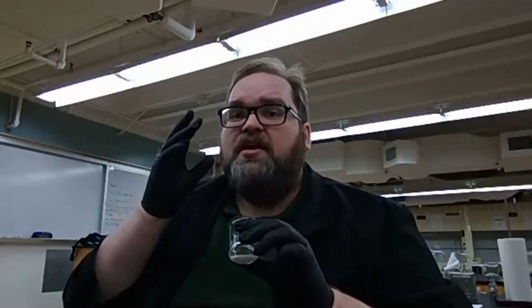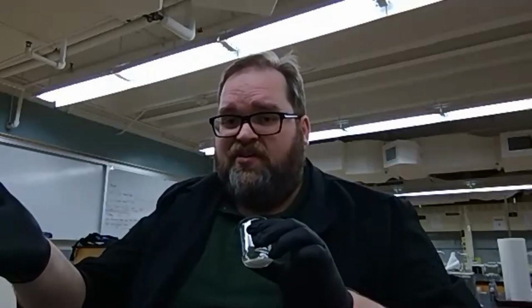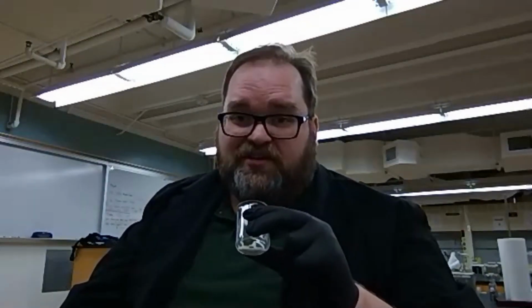To do this separation, what's great about this is that salt dissolves in water, but sand doesn't. We've all been to the beach, well, maybe you haven't, but we've all seen pictures of beaches where sand exists against water, so we know that sand is not going to dissolve, okay? But the water is salty, so we know the salt will dissolve.